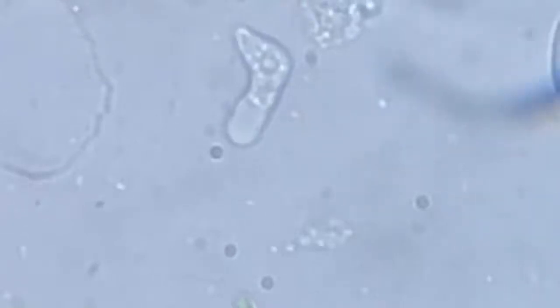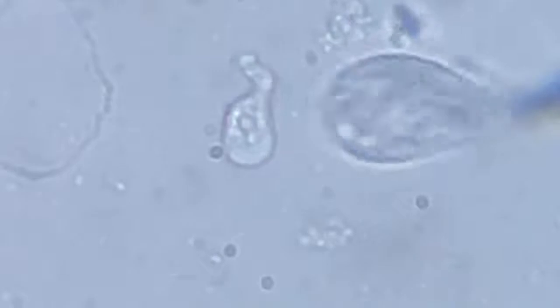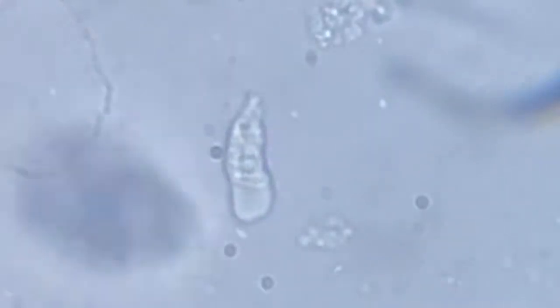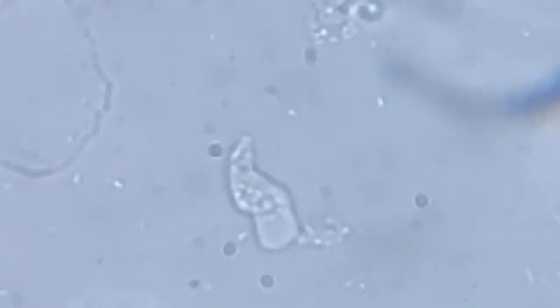So this is an amoeba. We prominently see its nucleus. The body is being taken in. It's progressing in a very fluidic manner. The cell organelles and the various cell inclusions are pretty highlighted here.